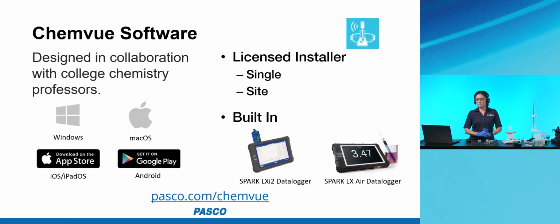Okay, so like I said before, we collaborated with college chemistry professors when developing the software. The software works with Windows or Mac, also iPads, iOS, Android tablets, and also the data loggers that Pasco has available, either the LXI2 or the LX Air data logger.